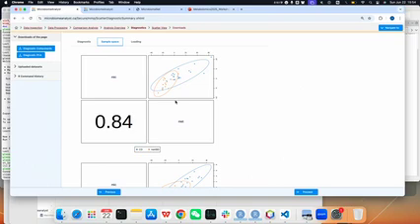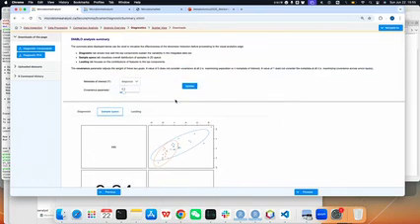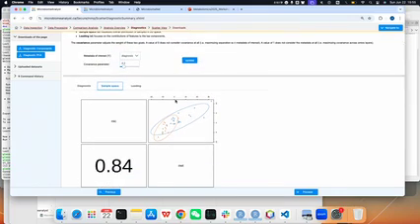Because this is a supervised method, it tends to align these 2 data together. So there must be some alignment signals between these 2, but they might not be the dominant ones in the whole data set, which results in different analysis results from different methods. So it's based on your understanding.